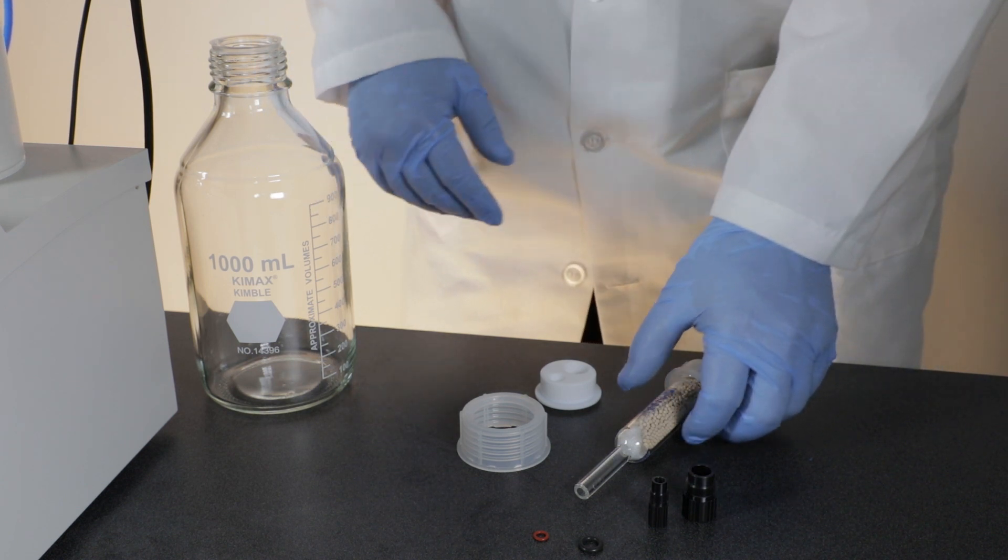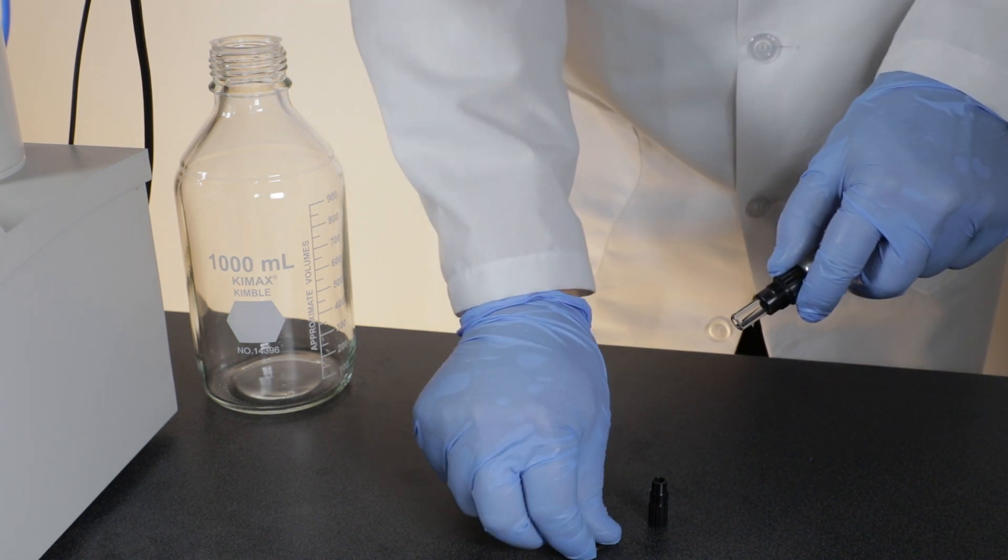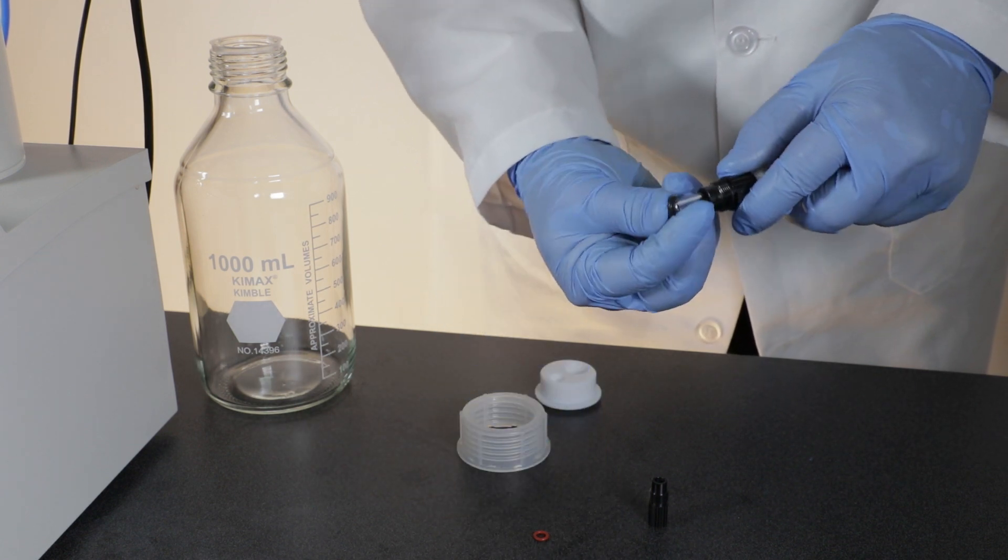Remove the 10mm and 5mm fittings and O-rings from the bottle top. Start with a desiccant cartridge. Insert it through the 10mm fitting and black O-ring and tighten it onto the bottle top.